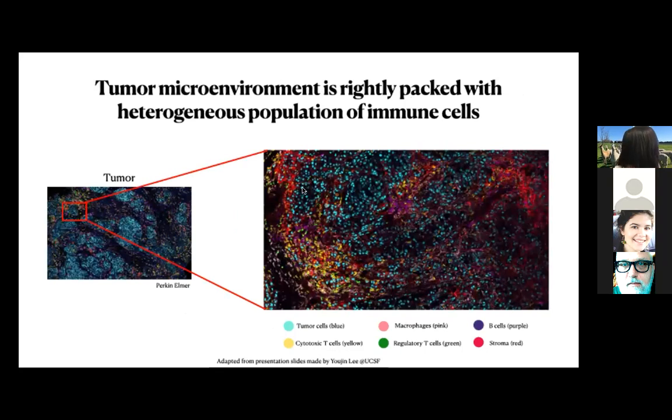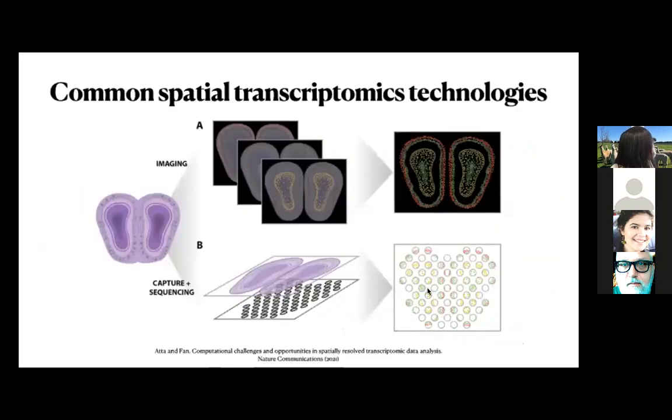This is just a zooming for the tumor tissue. You can see different cell types that are co-localized in different spatial regions. And so with all that, there has been a lot of potential and opportunities in both the wet lab and the computational side. Specifically for the wet lab side, this is a non-exhaustive overview, but mostly there has been 2 very popular branches of the wet lab sequencing technologies. The first is the top, basically it's using fluorescence in situ hybridization or sequencing approach. So a lot of different FISH methods have been proposed, even probably into this week.